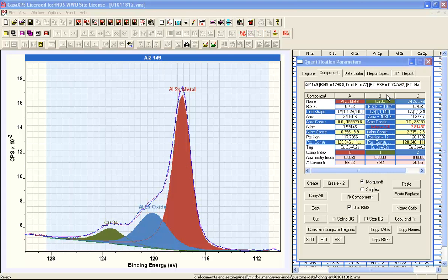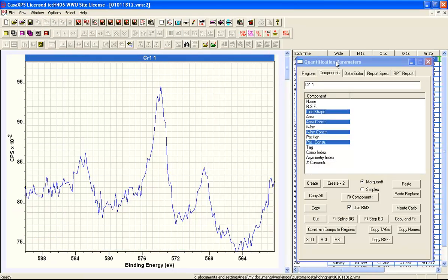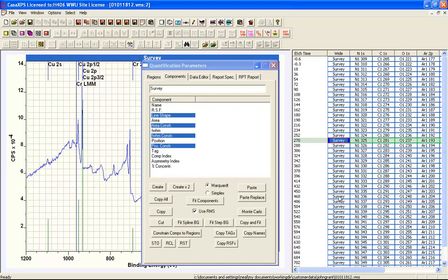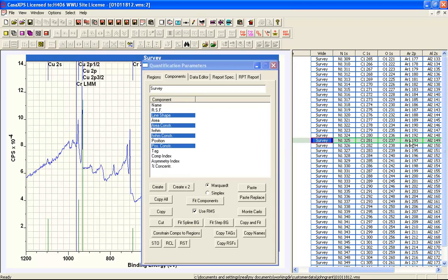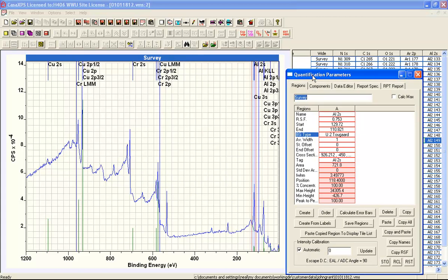Once an effective RSF has been calculated, we need to assign it to the region in the survey spectrum. We'll illustrate this using the survey spectrum and the aluminium data together. On the report spec property page, there is a button that says 'Update Regions Effective RSF.' To do this, we need a link between the components on the selected aluminium-copper region and the corresponding region within the survey spectrum.